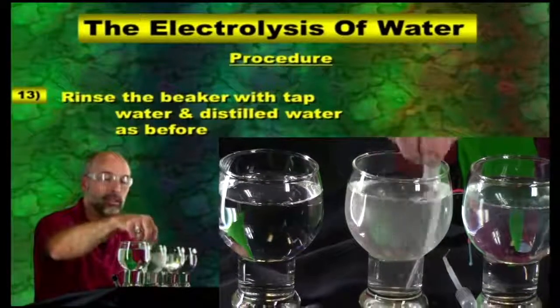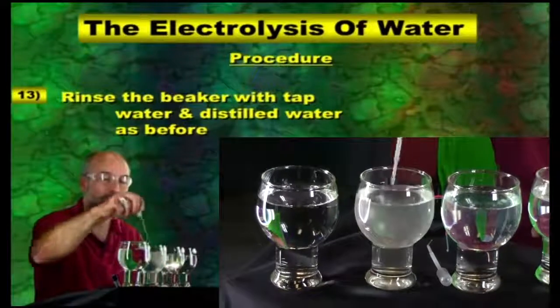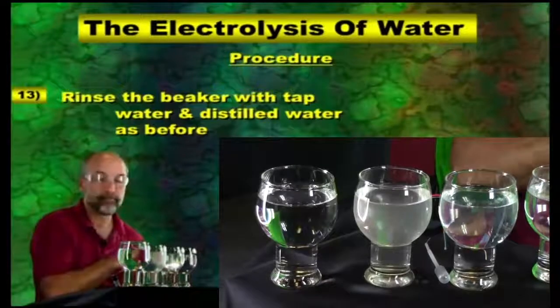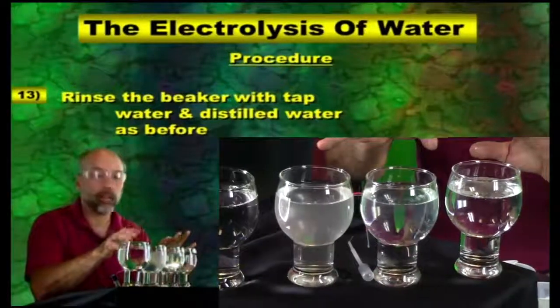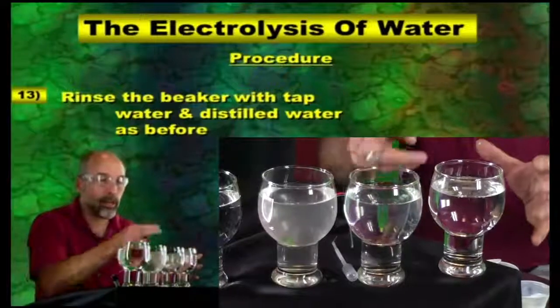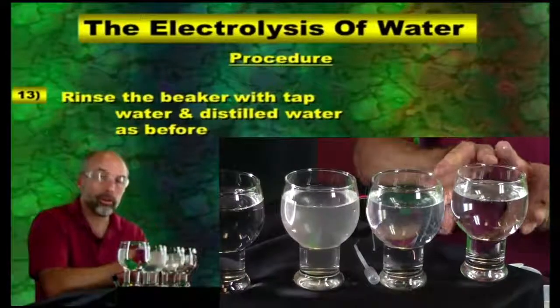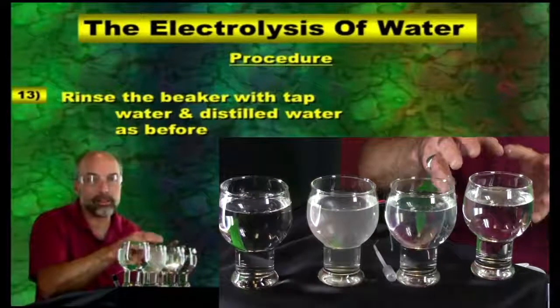Okay, obviously it looks like a different substance, just comparing the two that we have next to each other. I should mention one other thing before we go any further here. This one, which was water, had no experimental variable in it. It was simply water. We're testing everything against water. We'd say this is the control. So we have the control that we're basing this on, showing no indication that conduction of electricity is taking place. It's covalent.